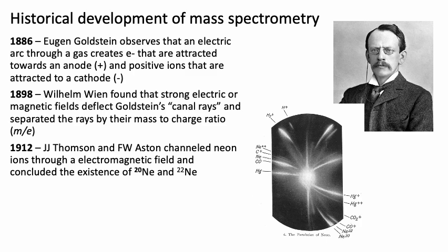If they're focused, they should still be able to pass through that small slit. Some of them, a percentage, I don't know, 5% or something. But then they would hit the back of the tube and not be deflected by the magnetic field. And they still need mass for it, because otherwise they would just neutralize the cathode, right? It's the same process during the reflection. Yeah, you would think. I think there's a certain probability that some pass through the hole, but it's very minor.